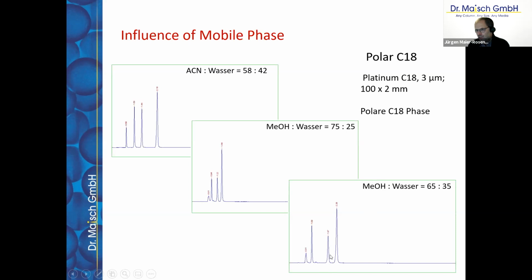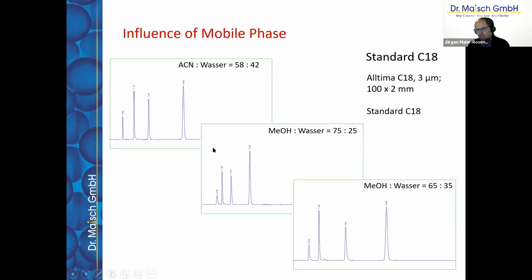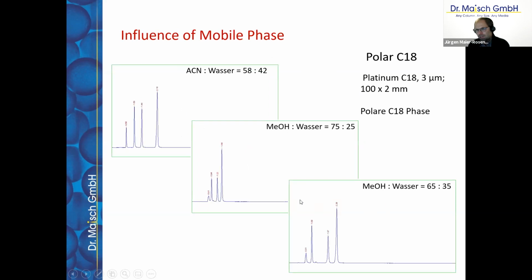We have a clear shift from, if we are looking from the standard C18, where we have the biggest distance of these two compounds, going here to this situation, to the polar combination, then we are coming here close together. So using these three different possibilities, we have a clearly nice tool for the method development.